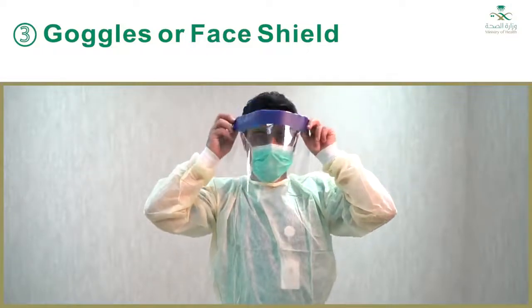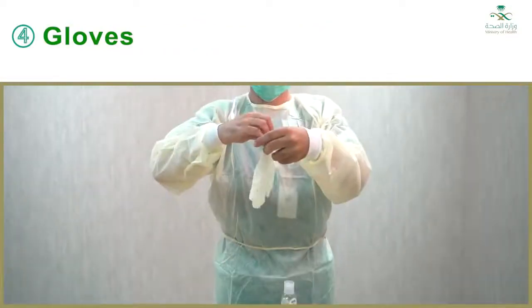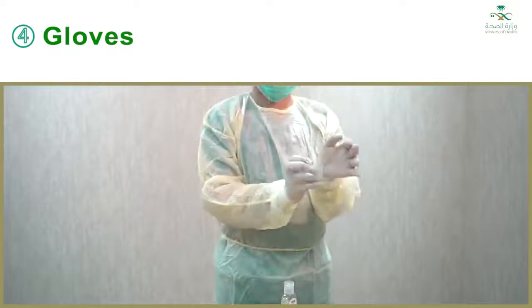Place over the face and eyes and adjust to fit. 4. Gloves. Extend to cover wrist of isolation gown.